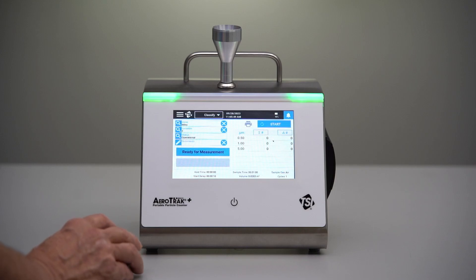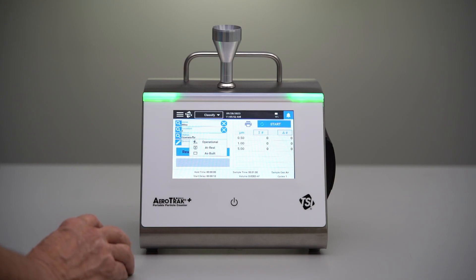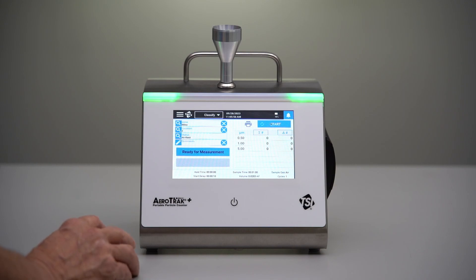If we were out in the clean room now, we would make sure that we have the right status of the room — probably at-rest, but it could be as-built or operational — and we click Start.